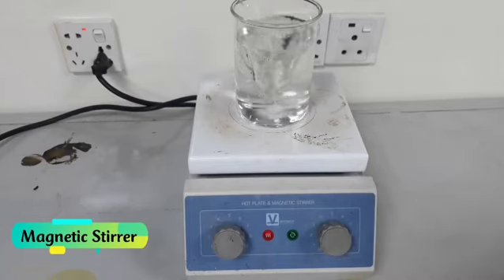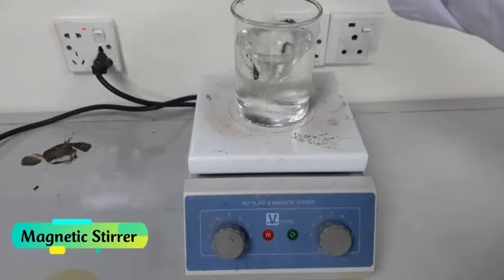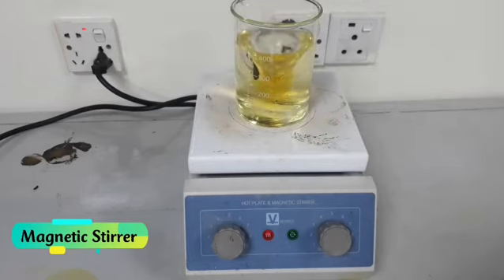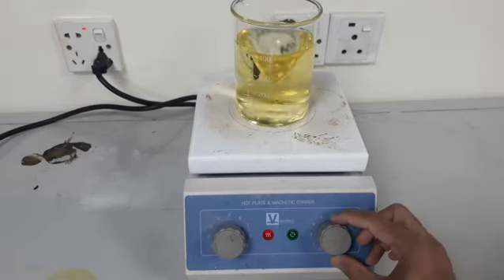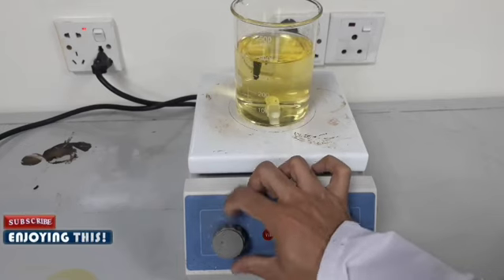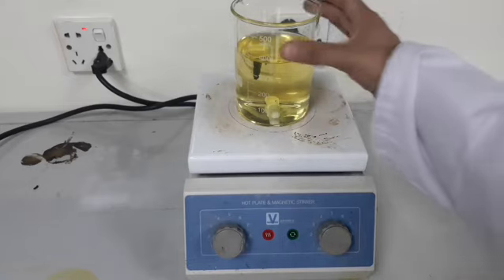The main components are: hot plate surface, usually made of ceramic, aluminum, or stainless steel, resistant to chemicals and high heat. Magnetic stirrer mechanism: it contains a rotating magnet or electromagnet beneath the surface. Magnetic stir bar: a small Teflon-coated bar placed inside the container with the liquid; it rotates due to the magnetic field. Control panel: a knob or digital control to adjust temperature and stirring speed. Heating element: it provides uniform heating.